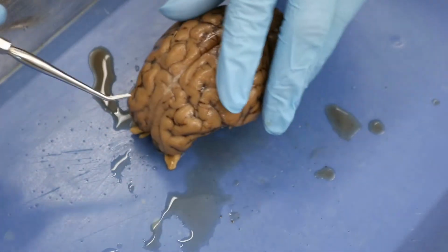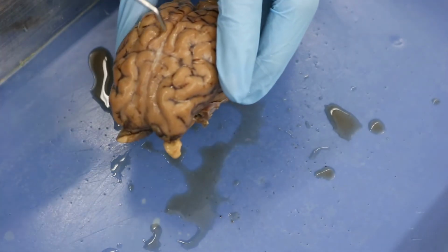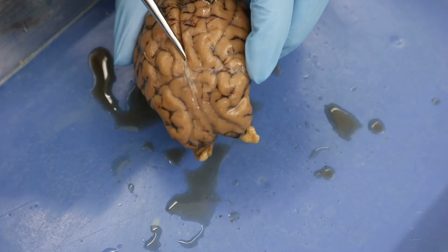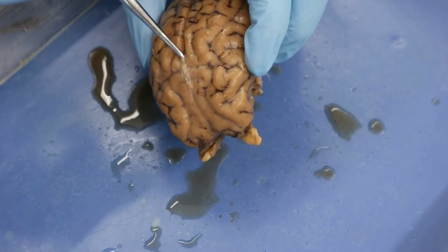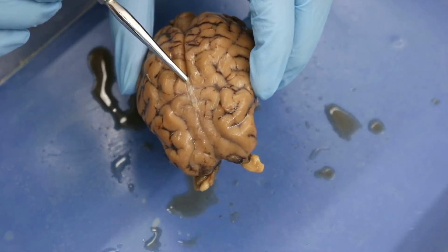And there is a little bit of it, on mine at least, in this anterior portion. You can see right in there. And so that's why my probe is kind of under it right now. So my probe can go in here, but it can't go any further because the falx cerebri is there, okay?